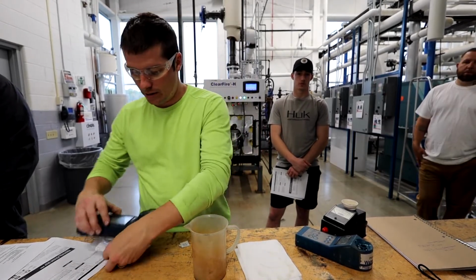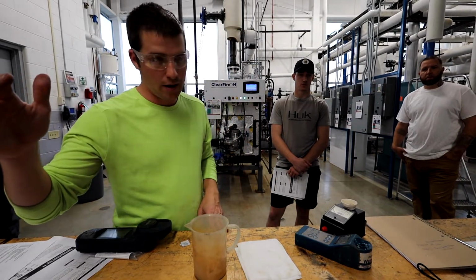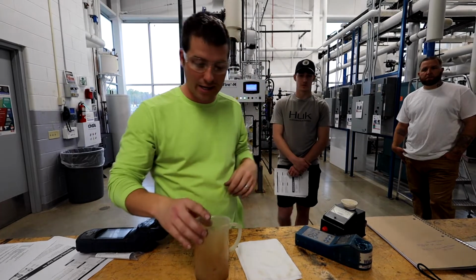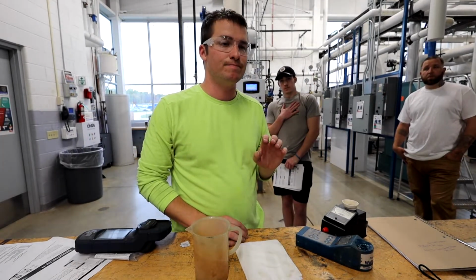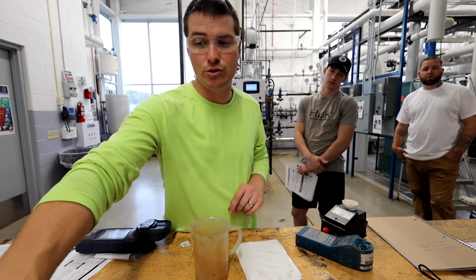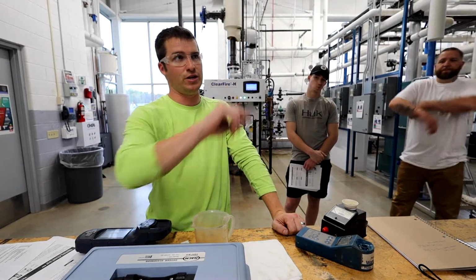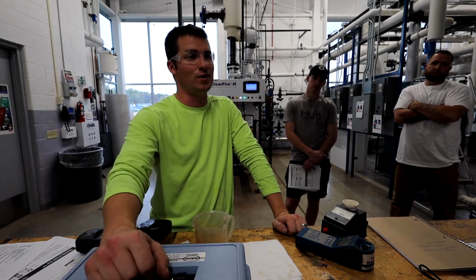All right. So we've done conductivity. We've done hardness. We've done iron. The last thing we'll do again is DHA. And the reason we do DHA: in a normal program where you're running sulfite, you're going to test sulfite in your boiler, not in your feed water tank, all right? DHA, we test in the feed water tank, not in the boiler.